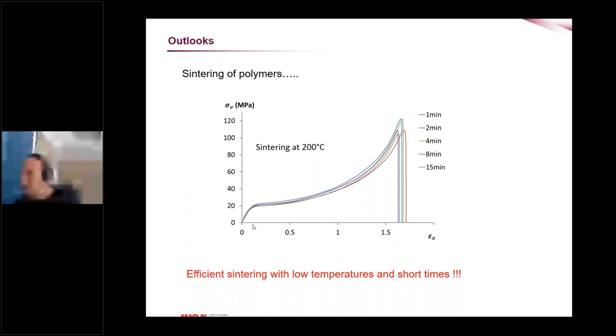This is a mechanical law. Now, clearly, what you have to be careful about is definitely the contact between the grips, I mean the anvils, and your samples. So we did a lot of different trials with Florian, and maybe Florian will be much more able than me to answer that. But definitely, having graphite and nickel paste helps a lot to avoid barreling. Now, in some cases, for certain materials, you have to be very careful about the electrical conductivity and thermal conductivity. You may end up with tantalum foils between your samples and the anvils.